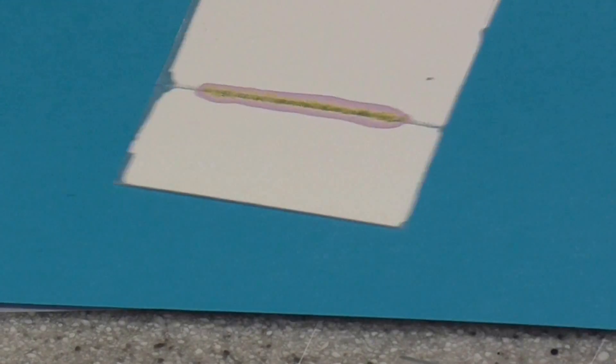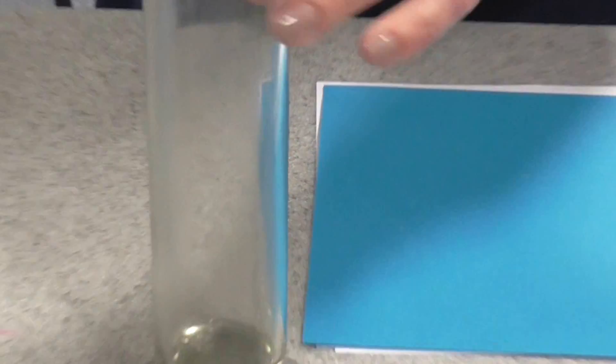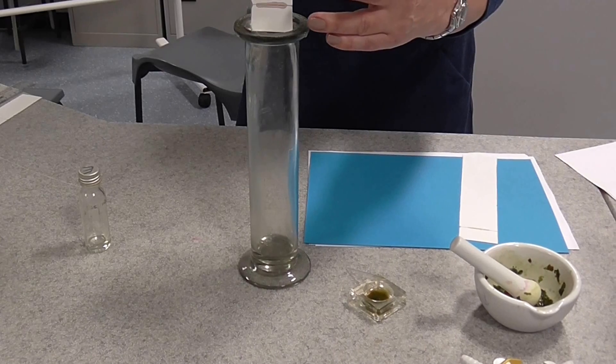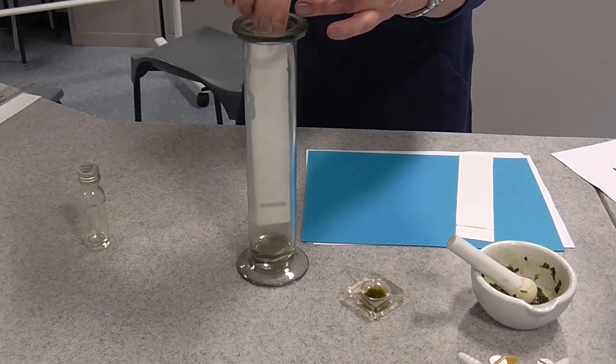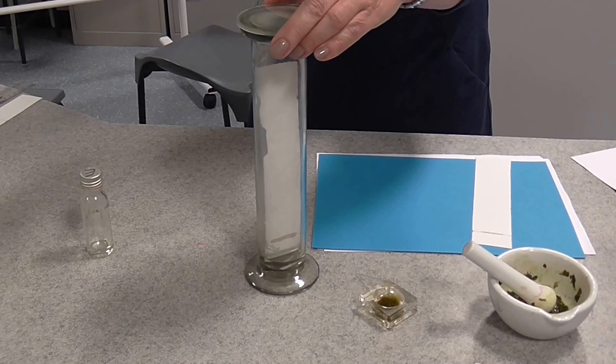Now, once you've done that and it's dried, you can actually place that and I'll do that one now inside the gas jar with the solvent. To be honest, it's better if it doesn't touch the side, so it's better down there.